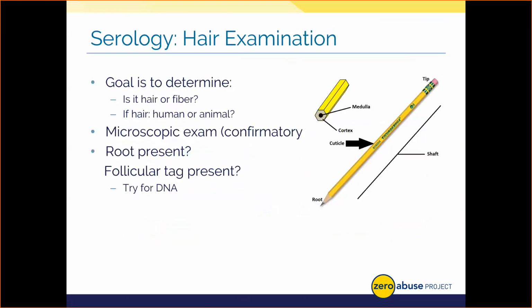Hair testing is a confirmatory type of test. In short, we can tell you if something is hair versus a fiber and if it's human or animal hair. Again, we use a microscope and we take a sample of suspected hair and examine its external and internal features using that equipment. I always liken as an analogy that hair is like a pencil, and good analysts use some kind of similar analogy in court.